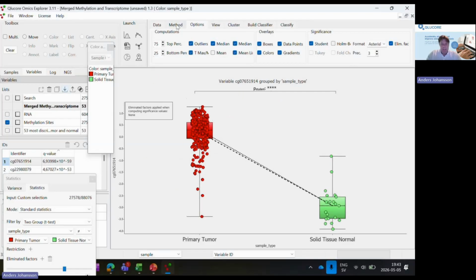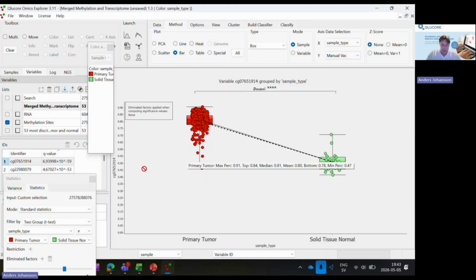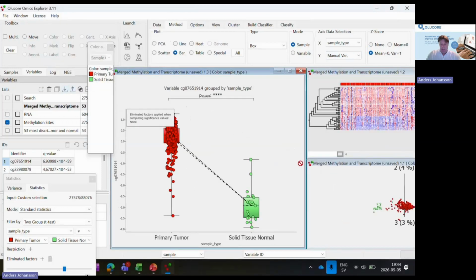One more thing that I wanted to show here, which I forgot, is that we are now looking at the normalized Z score here on the y-axis. We can change that to the original methylation values, which range from 0 to 1. And look at, so that the y-axis is changed now to this. Let's go back. And quickly then just tile the plots we have done.